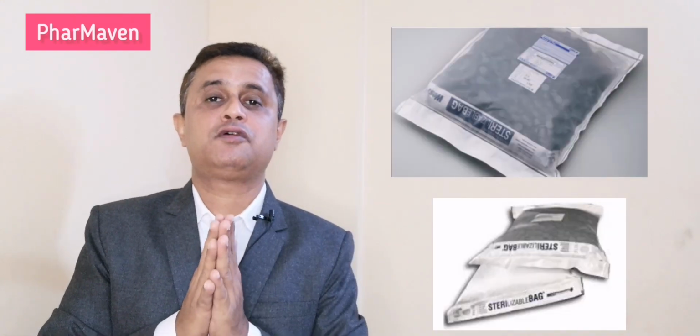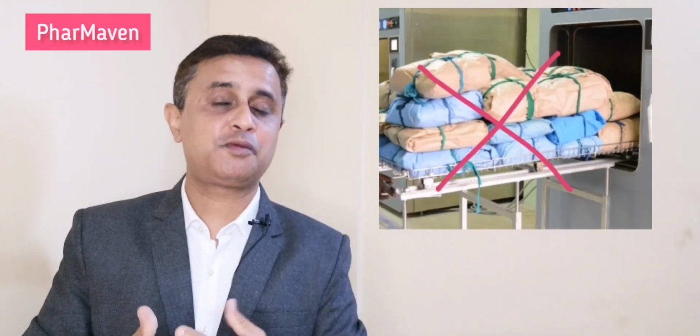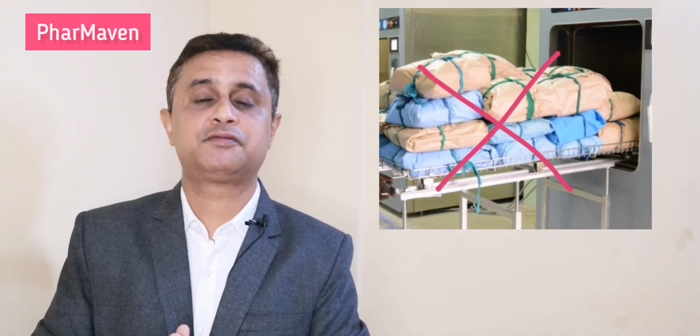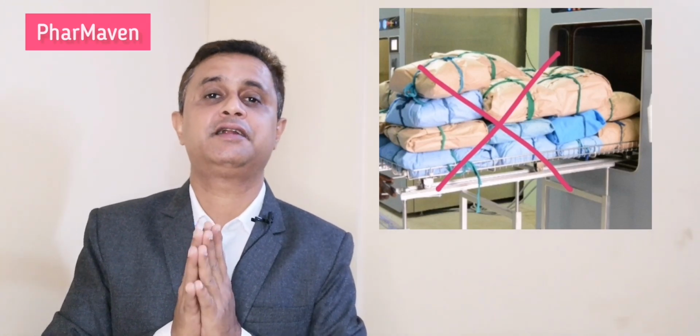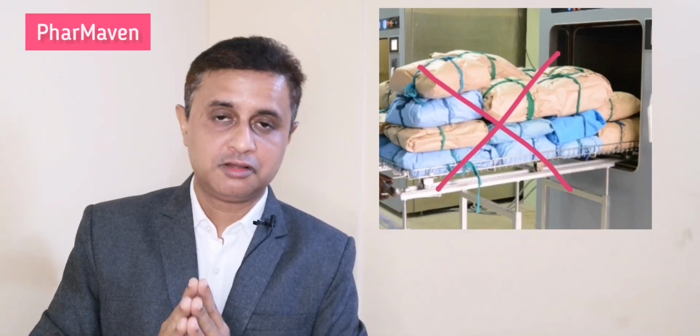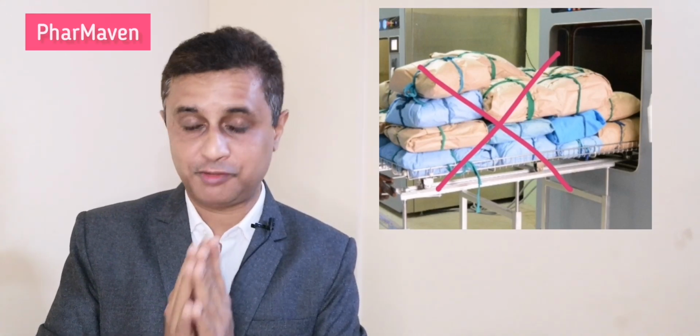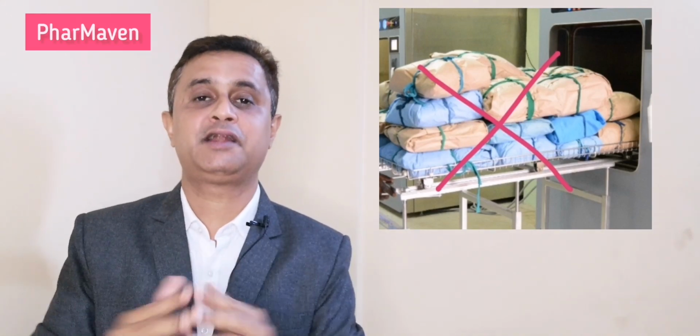If you place high moisture items like garments, or stoppers which contain a very high amount of moisture, and you don't distribute them properly, it will generate a lot of condensate, and your lowest shelf load items may not get proper steam exposure because a lot of condensate is falling on the load. So this is a frequently asked question, how do you determine your load pattern arrangement.